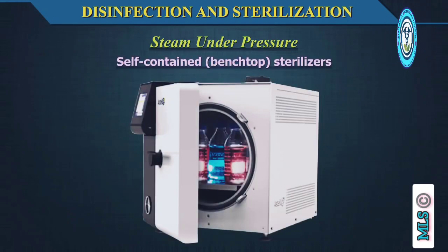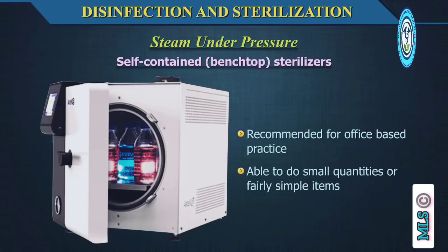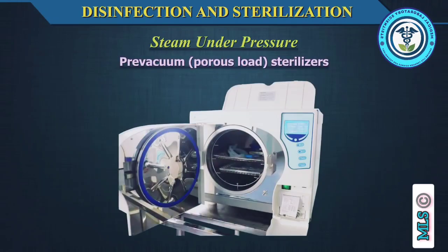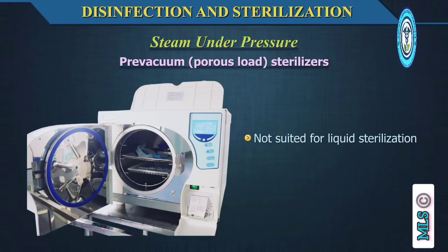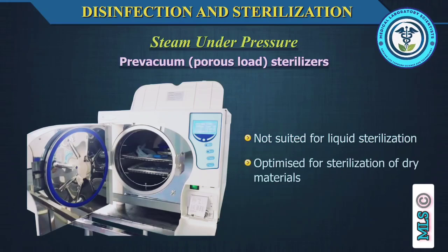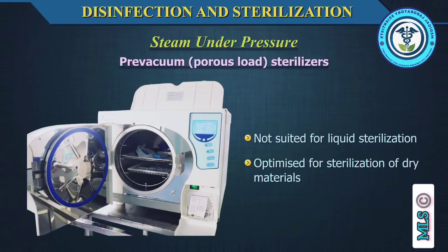Self-contained or benchtop sterilizers. These are recommended for office-based practice as they are able to do small quantities of fairly simple items. Pre-vacuum or porous load sterilizers. These are not suited for liquid sterilization but are optimized for sterilization of clean instruments, gowns, drapes, toweling, and other dry materials required for surgery.